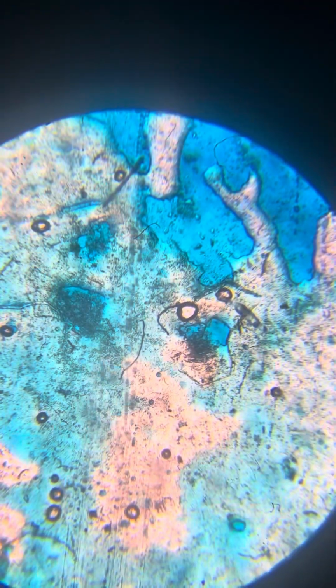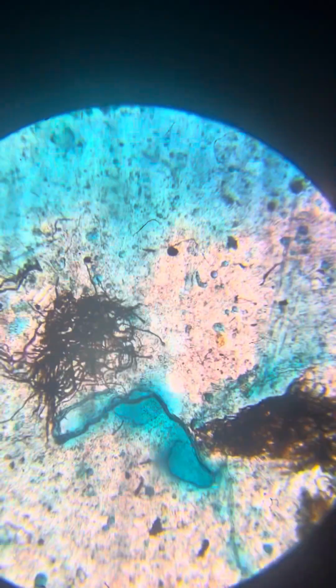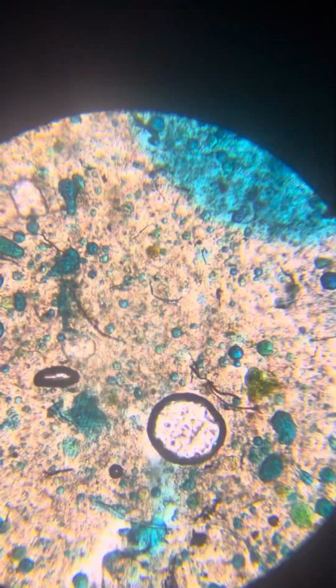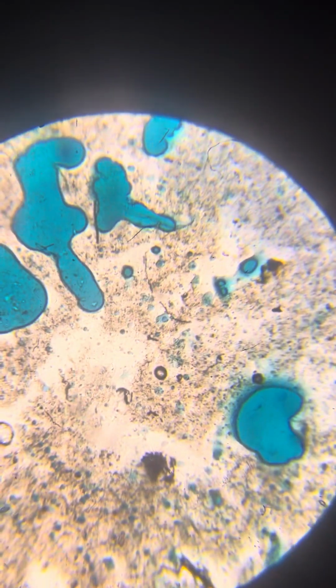Nice. So we see duds as well, but mostly they are real Neros of all sizes, which is exactly what we wanted. Not just the huge ones, but also quite a bit of small ones. Beautiful, really. I'm just too anxious now to get to the stage of creating the culture, so I'm doing it quickly. But this is actually an impressive slide, one of the more impressive that we've seen recently, since the return to science in the last couple of weeks. This is an excellent one.